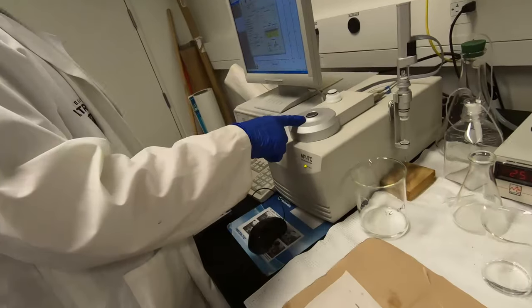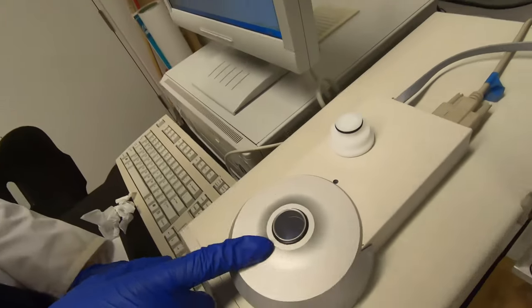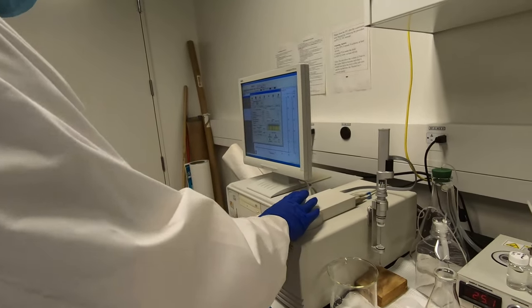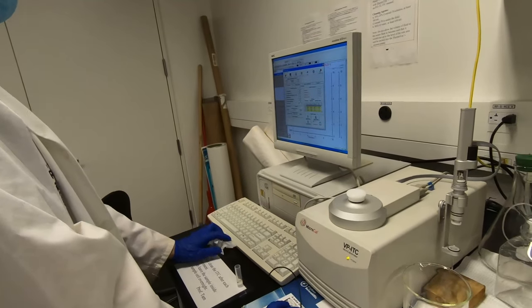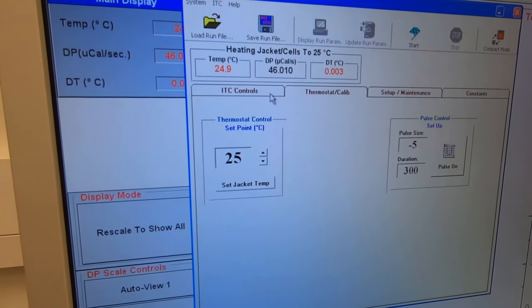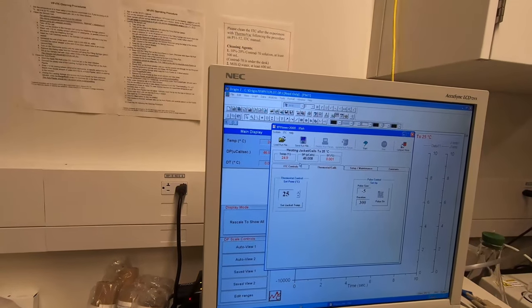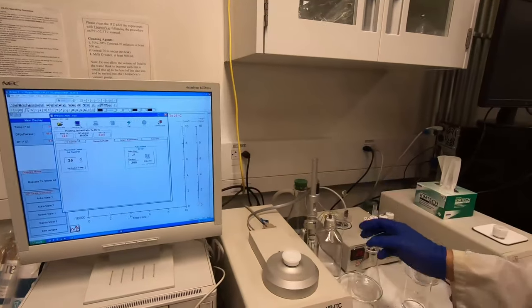Now you can no longer see liquid in the funnel, but you know the sample cell is already filled with your sample. Put the ITC back and it will change the temperature to what you set for this experiment. For example, the cell temperature is set to 25 degrees Celsius, so it will begin to heat the cell to 25 degrees. Meanwhile, we can fill the injection syringe.